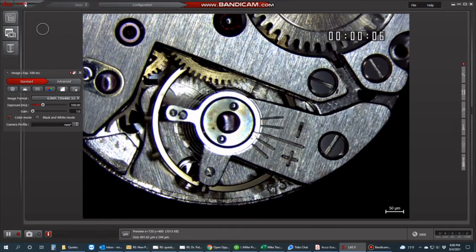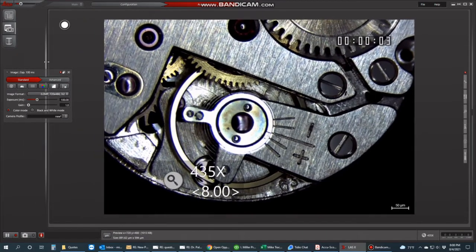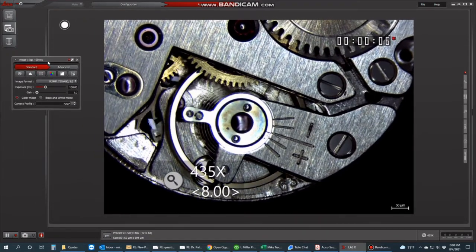You can also use this slider here to shrink the icon sizes. It gives you a little bit more space here. You can also even adjust the image so you have a lot more space to move this around.